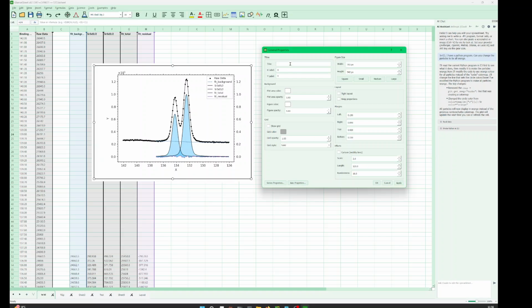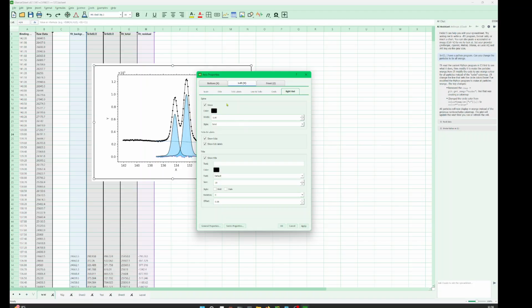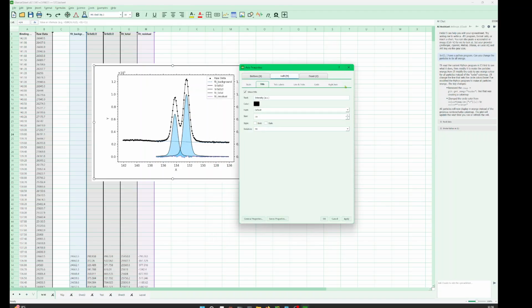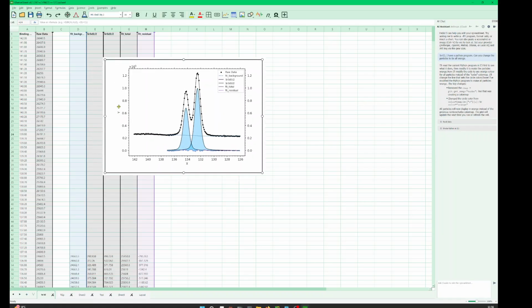Ah, yes, sorry, the title was not written, and nothing written in the right axis. I think that was it. There was no title. Okay, so again, this is a plot. I don't think you can create it using Excel.